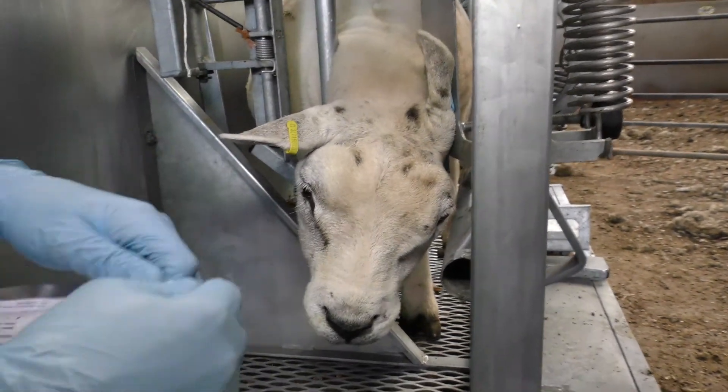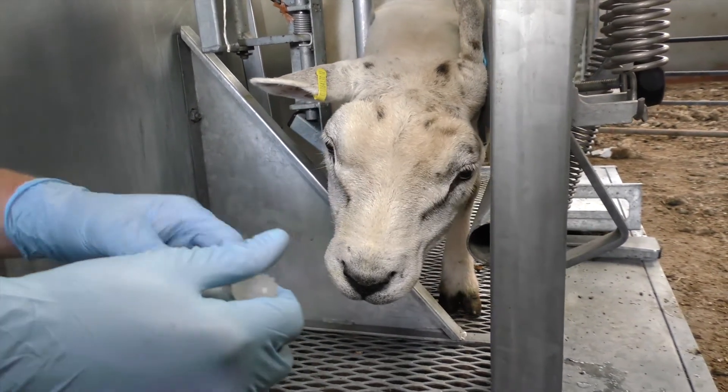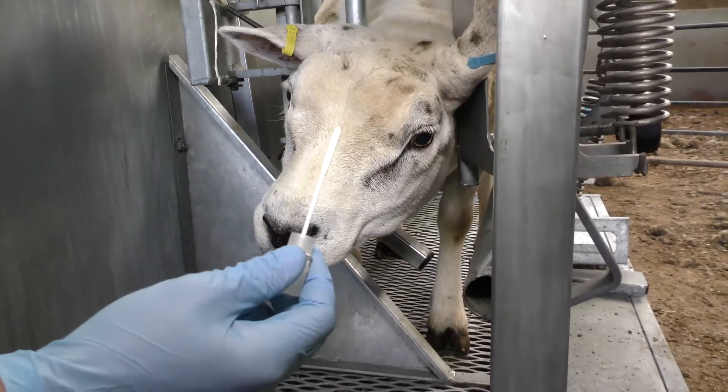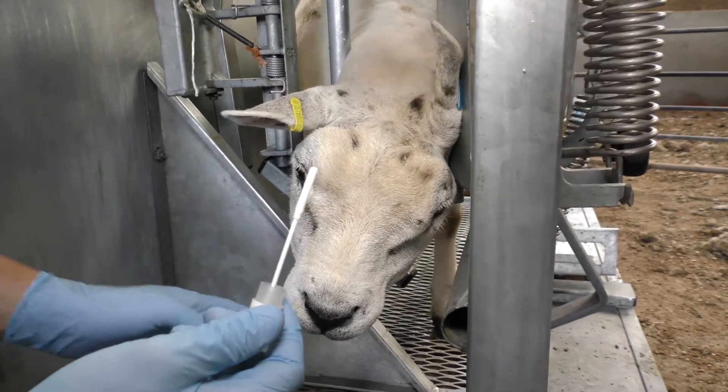So then take the swab out of the packet and then take the swab out of the tube, and make sure that the end of the swab doesn't come into contact with anything apart from the inside of the animal's nose.